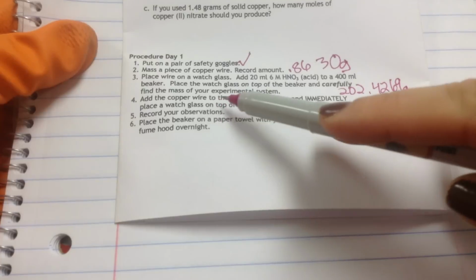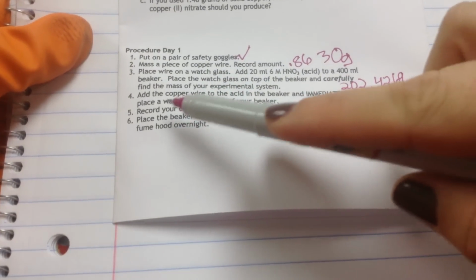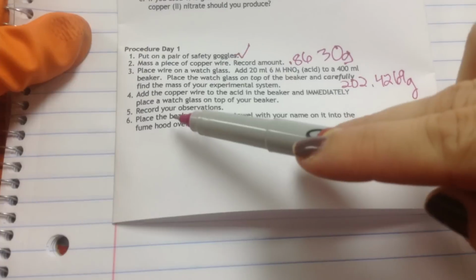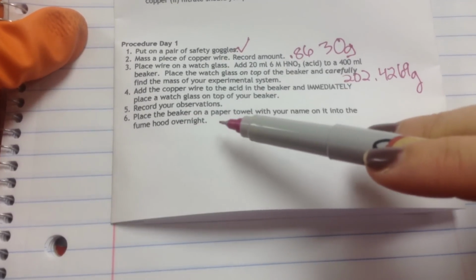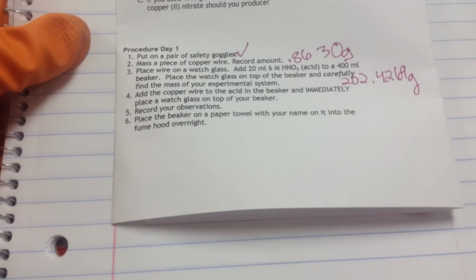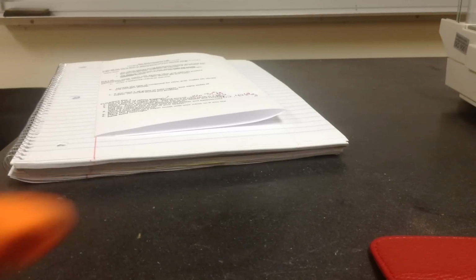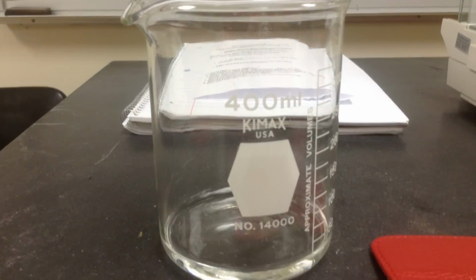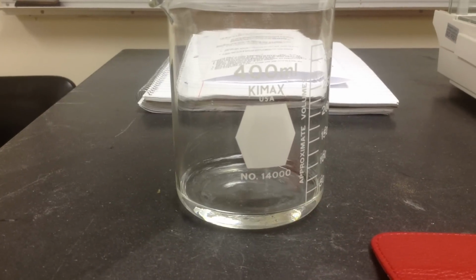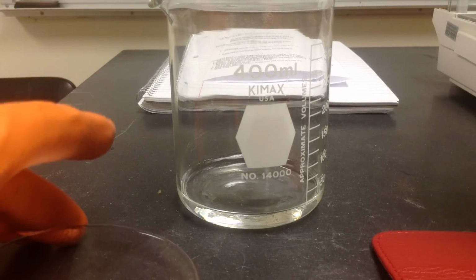Add the copper wire to the acid in the beaker and immediately place a watch glass on top. We'll record any observations. Then we'll place the beaker on a paper towel with our name on it into a fume hood overnight. That would be so we don't confuse that with other groups' work, but we're just going to have our one demonstration. So let's move that in this area here. And let's add the copper.